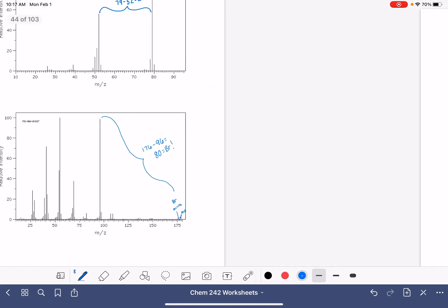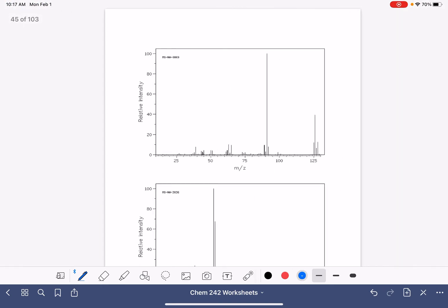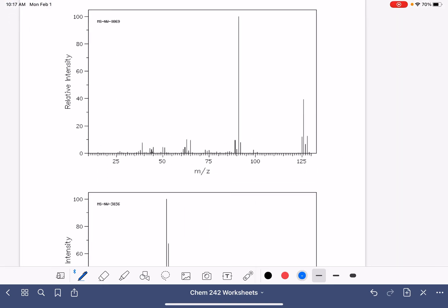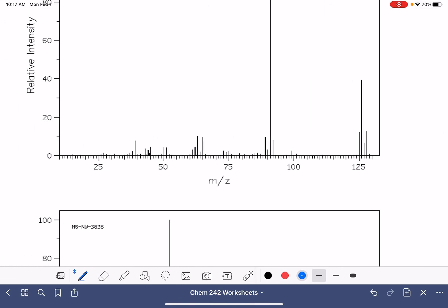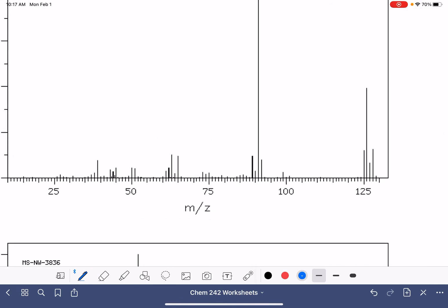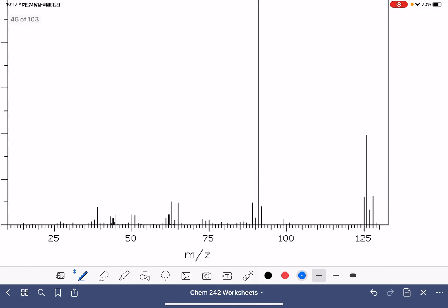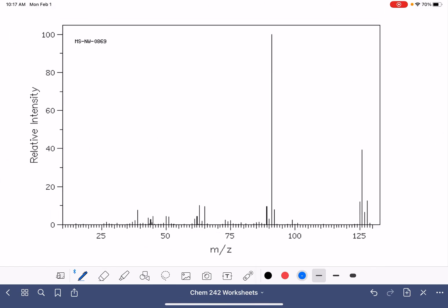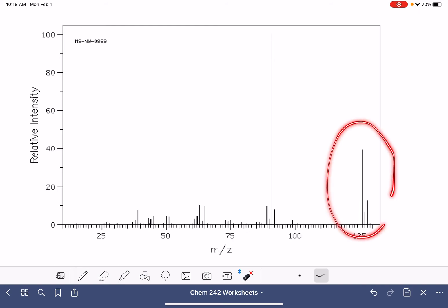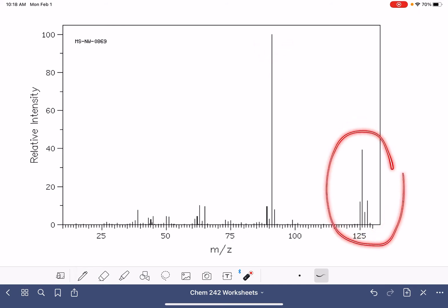We've got two more to go. So here's one. First, we're going to find the M plus peak. We want to look at the right hand side, not the biggest peak in the spectrum, but the biggest peak on the right hand side. So there's our M plus peak right there.